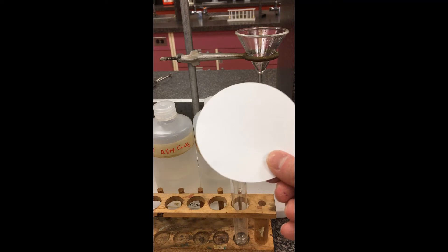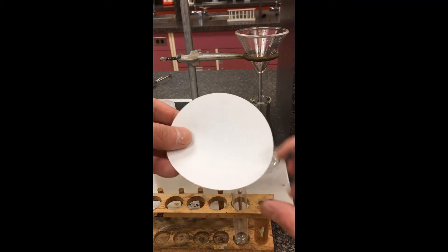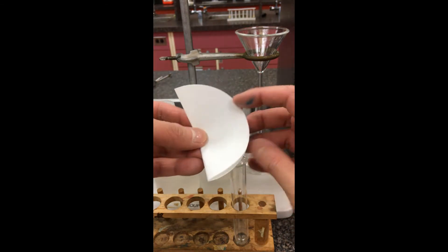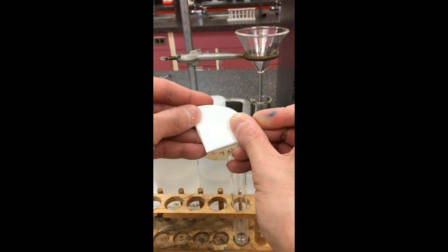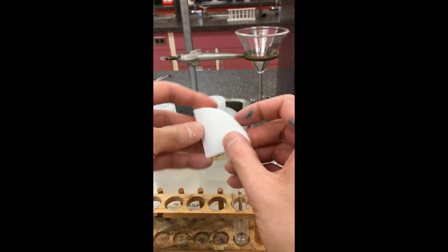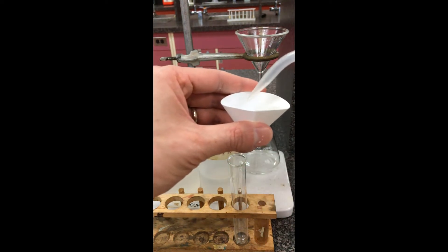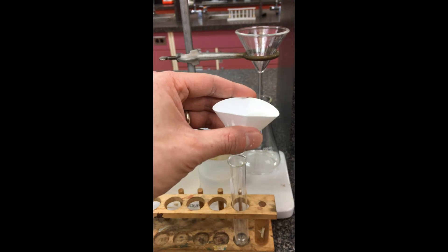So for this filter paper here, I'm going to fold it in half. We're going to fold it in half once more, creating a little cone-like shape. Usually we wet it a little bit just to make sure it can retain the shape, especially when it is in the funnel.